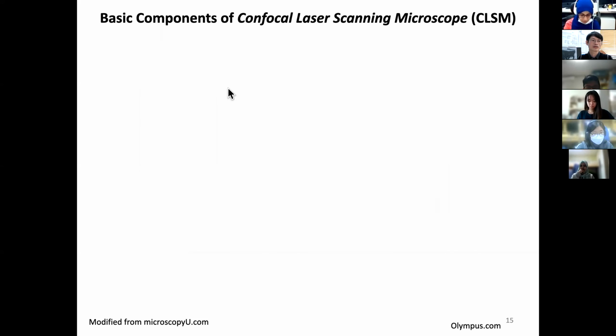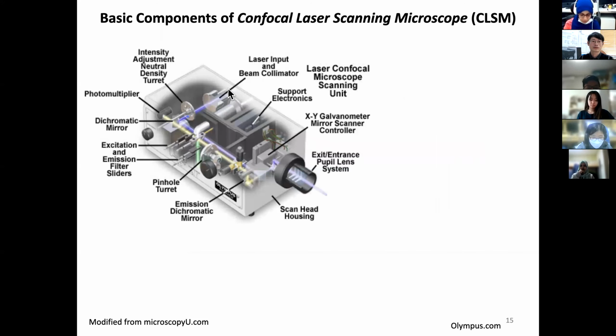And so how does the confocal microscope look? Here comes the real shape, the commercial one, because you usually don't have the right to open up the commercial microscope. Here I actually show you instead. The cool thing is they do a good job, so you can plug it into an existing nice modern microscope, right?